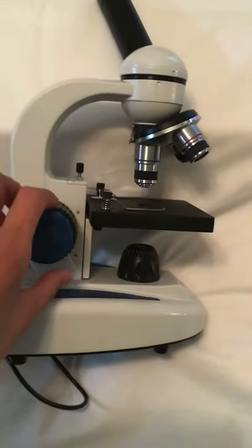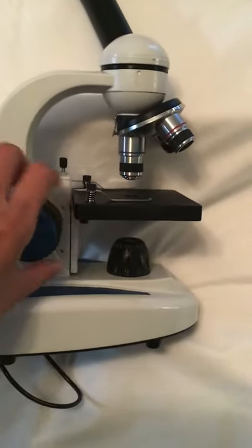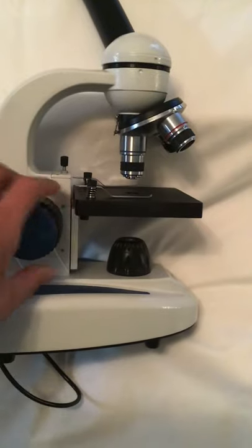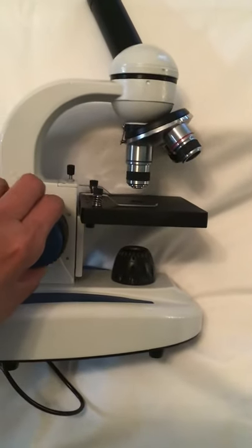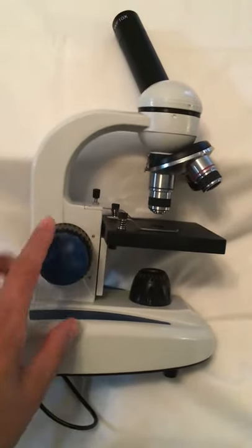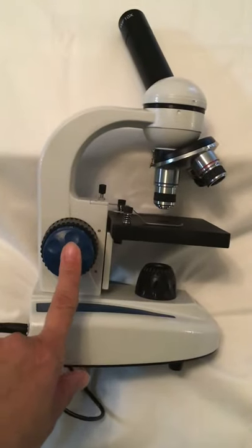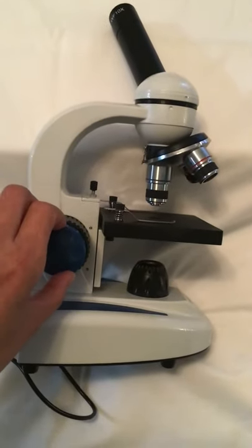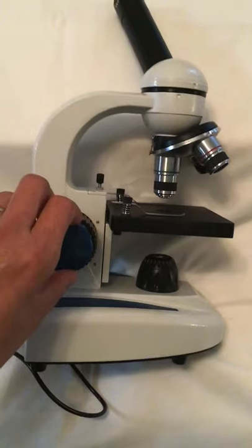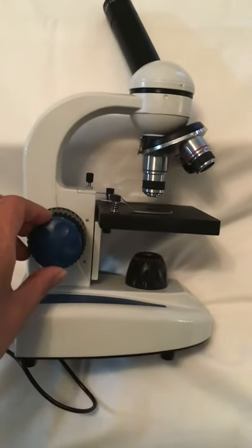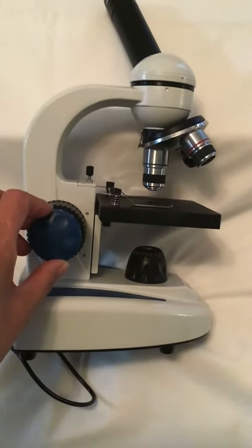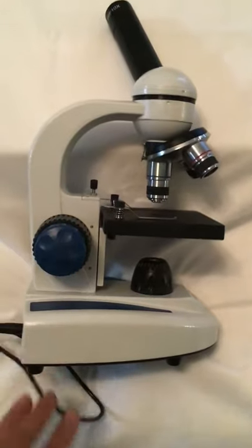Once you have set your slide on there and you've got it to the lens that you want to examine your specimen through, you will then use the fine adjustment. As the term implies, it fine-tunes the image. So you just kind of rotate it back and forth until your object is crystal clear.